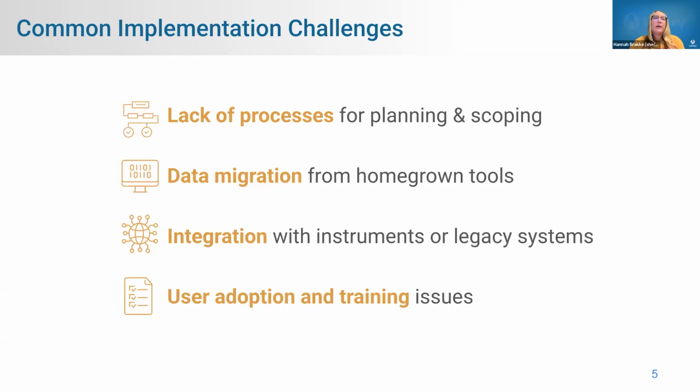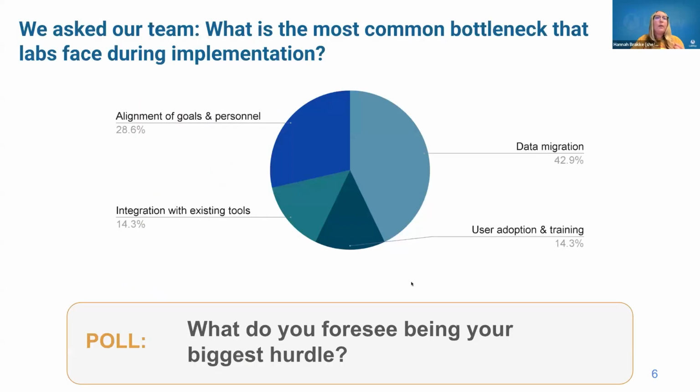And then the last one, really, that we've kind of created this bucket for, is around user adoption and training. And so you can have the implementation, you can have your LIMS up and running, and then it may take longer to get off the ground if you haven't really considered how you're going to roll this out to users and ensure that training is there as well.